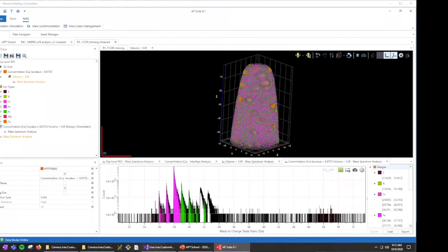Yeah, and you can consider an ion inside of an isosurface even if it has holes, based on just looking at the nearest triangle. This is what we do actually. You look at the nearest triangle, consider the triangle an infinite plane, and look at which side of that infinite plane you're on. Is that generally the containment test that you use? Yes.